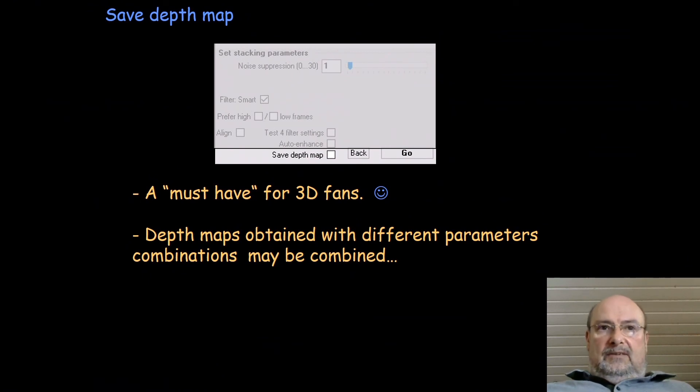Last but not least, the depth map. This is generated every time but it's not automatically saved. You have to click it here to choose it. Definitely it's a must-have for 3D fans because the map can be used to make synthetic 3D images. You can have the maps obtained with different parameters and then you can combine them, edit them, and so on. Therefore for 3D fans, always use the save depth map option.